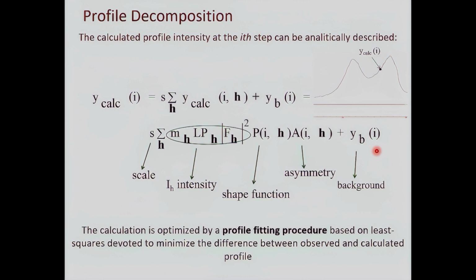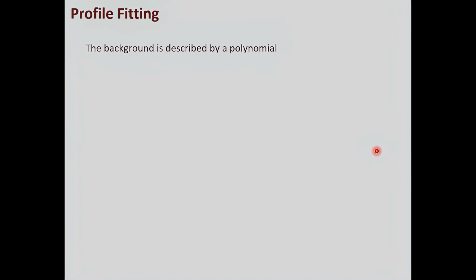Obviously, because of the problem that I said, we need to perform profile fitting to refine some quantities, a profile fitting procedure which is based on least squares. And in this case, the idea is to minimize, obviously, the differences between calculated and observed profile.